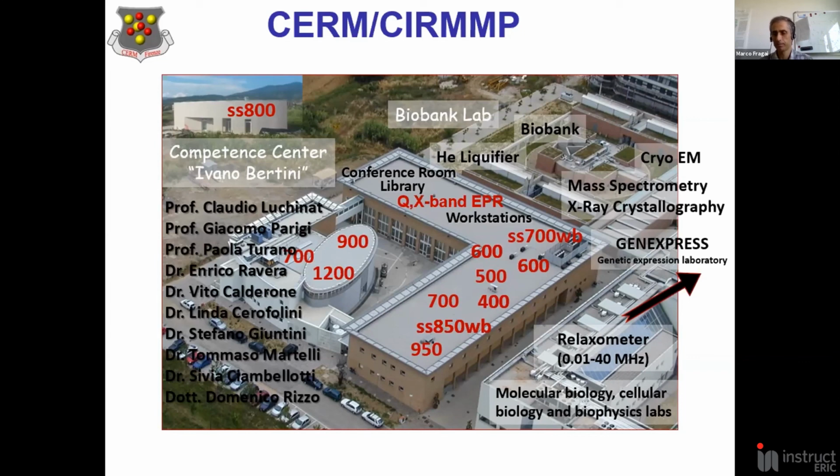In case of proteins bound to nanoparticles, what is generally the measurement time compared to the protein sample alone? I think much more, because the amount of the protein is a small fraction with respect to the total sample. So, for example, the HSQC you have observed in the presentation were collected in 1 week.